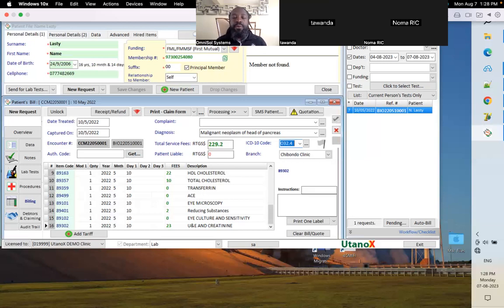Okay, so we recommend a LAN cable network because apart from being secure, it's much more stable. Wi-Fi works, but it's up and down, it's unstable. For a laboratory, the traffic generated is too intense to depend on a Wi-Fi connection.